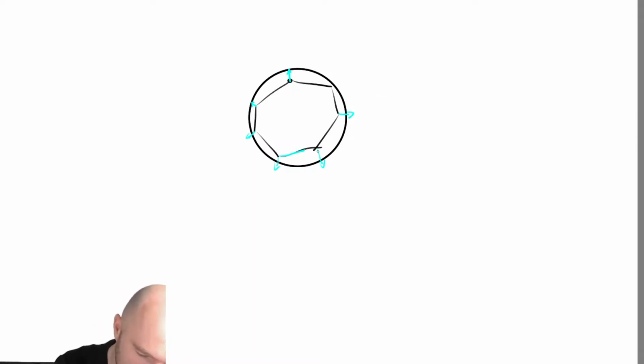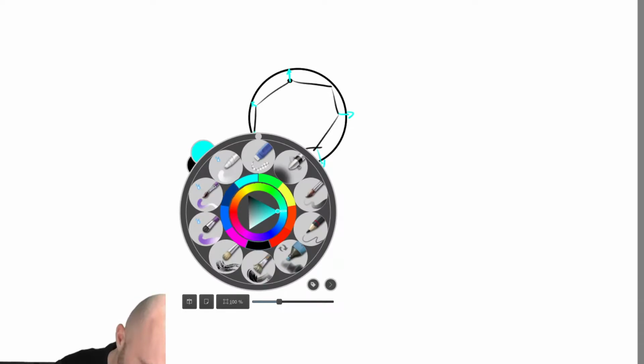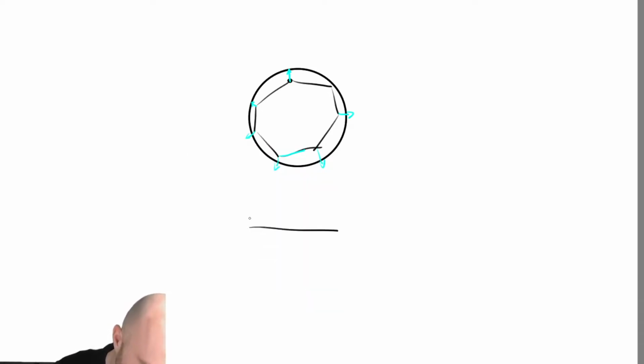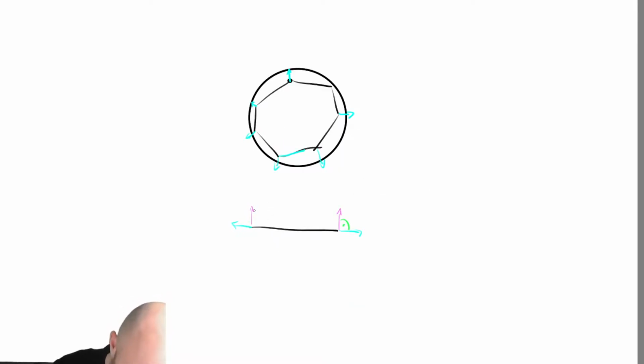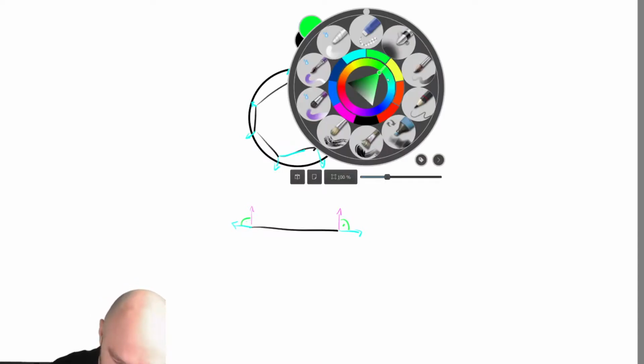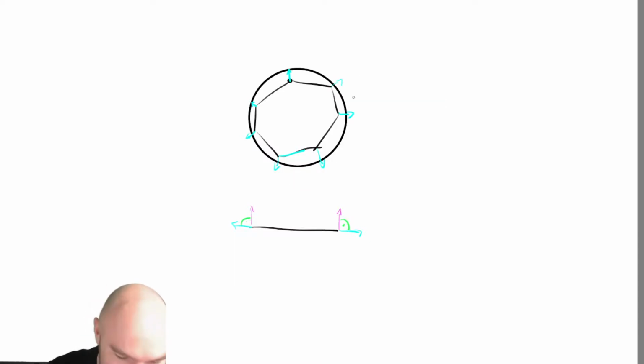And if you look from the side, so this is now from the top, and if you look from the side, it will just look up what the surface normals are. So we'll just create the surface normals and make sure that these vectors are normal to the surface normal of the adjacent triangles. There's a little bit of math involved here. I'm not going to bother you in detail, but you can look into the algorithm. It was a bit of work to write that one, but that's fine. It's been written a long time ago.